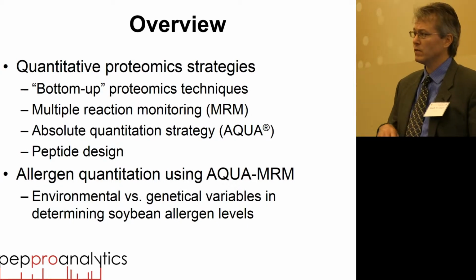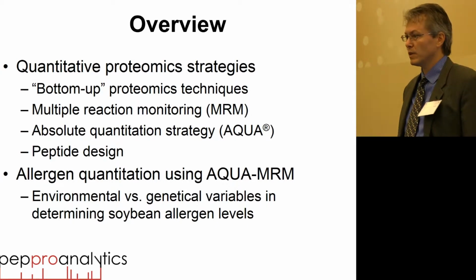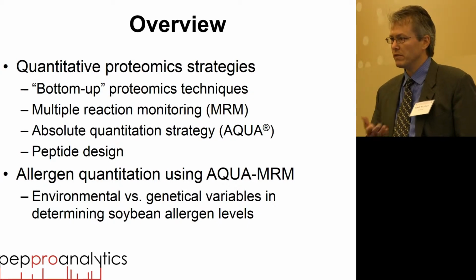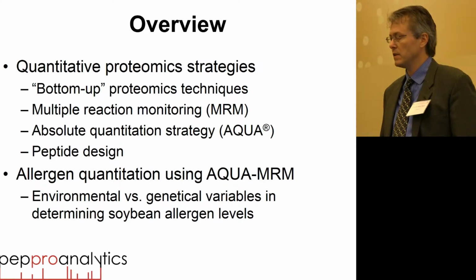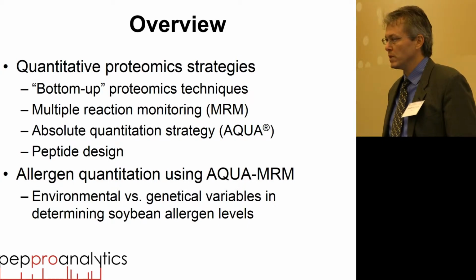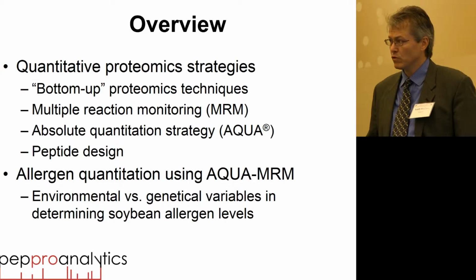Also recognizing there was a lot of focus on what was available at the time, which would have been some kind of electrophoretic technique. Two-dimensional electrophoresis was obviously out there in the literature, and so the goal, at least for the PATC, was to take a look at something that might lend itself to a multiplex approach, so multiple proteins, had the potential to be quantitative, which has really just been developing quickly here the last few years, and that's what a lot of this is.